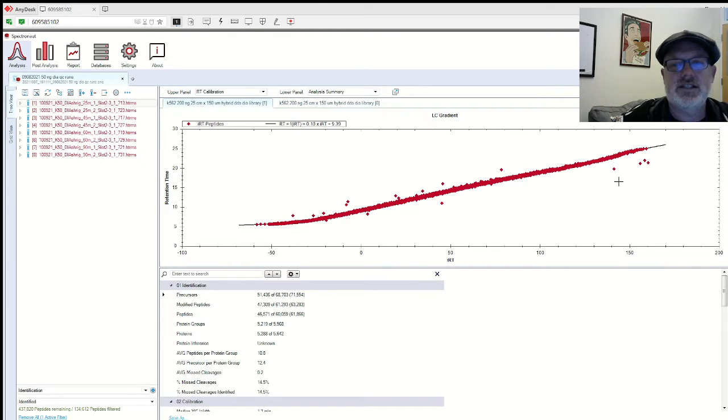I will explain what DIA data is, and there are some videos we made last year that explain it. But all of these are the peptides that we're identifying in the run. It converts the retention time. Remember, we're doing LCMS, so peptides are eluting on an LC column over time. Instead of physical time, which would be here on the y-axis, retention time in minutes, and you can see this run is only 30 minutes long, it can convert the peptides into what's called IRT space.